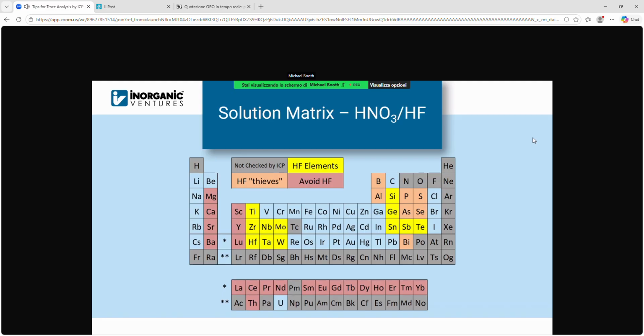They're fine. But we really wanted to highlight some of these other elements, like the yellow elements at first. So when I mentioned hydrofluoric acid being needed, these are the elements in nitric acid that need to be stabilized with hydrofluoric acid. So you have that block there with titanium, zirconium, and niobium, molybdenum, hafnium, tantalum, and tungsten.